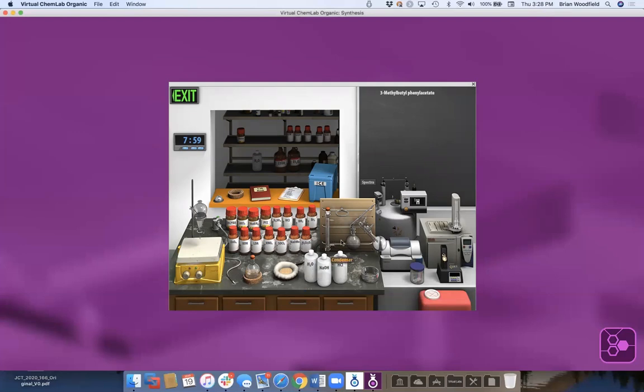So some things I'm not going to show right here, but if you had a mixture, all right. So let's get rid of this guy. I'm going to interrupt for just a second while you're prepping there. The answer key for the instructors does tell how long each experiment takes and the ideal starting materials, and it gives a lot of detail. I just checked for you.